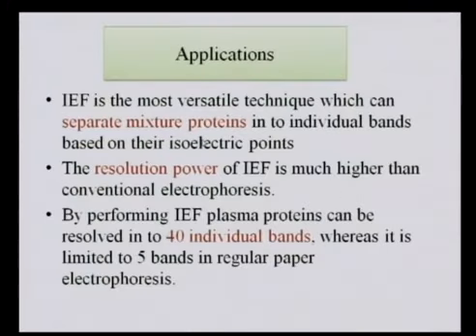So now we will know something about the application part of the IEF. As we have discussed the applications of SDS PAGE in our previous sessions, now we will discuss the application part of this IEF. Here IEF is responsible for the separation of a mixture of proteins into individual proteins. If you take any tissue and subject it to homogenization, the crude homogenate which you have obtained you can subject to IEF, and from that you can separate the individual proteins. That means crude can be separated into individual proteins.